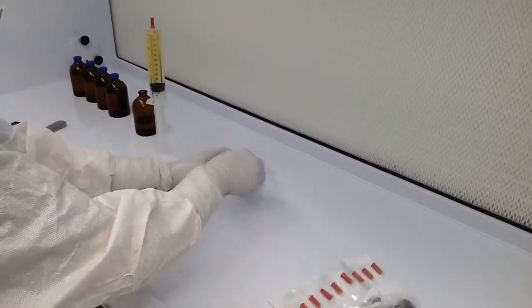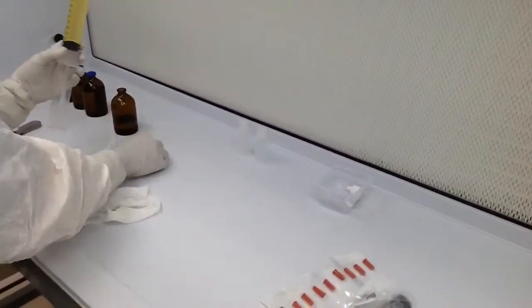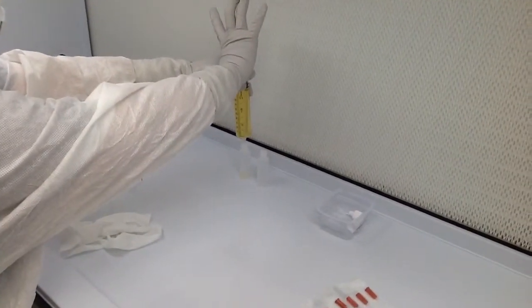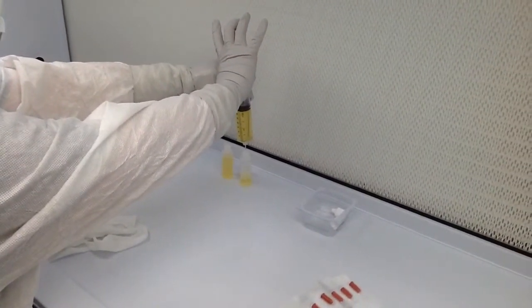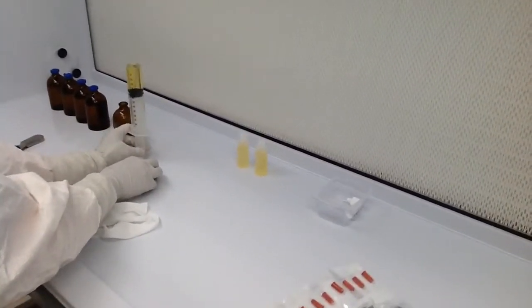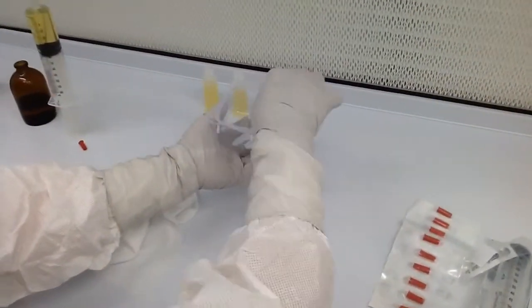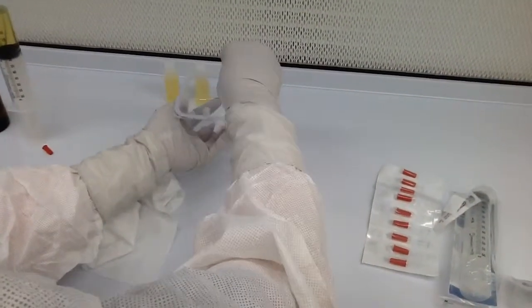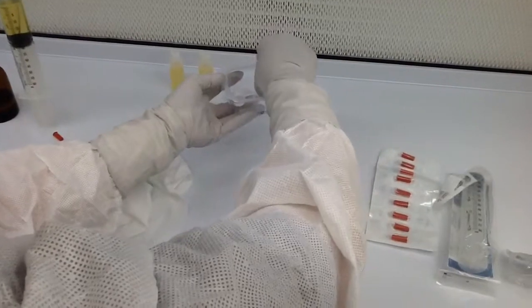Now we're going to take our droppers. This one is a 15 milliliter dropper. And we'll simply transfer the solution into the dropper. The last part of this step will be to sterilely and aseptically place the cap onto the dropper. And the best way to do this will be to scoop the lid into the part that's going to touch the eye, so the dropper never touches anything.